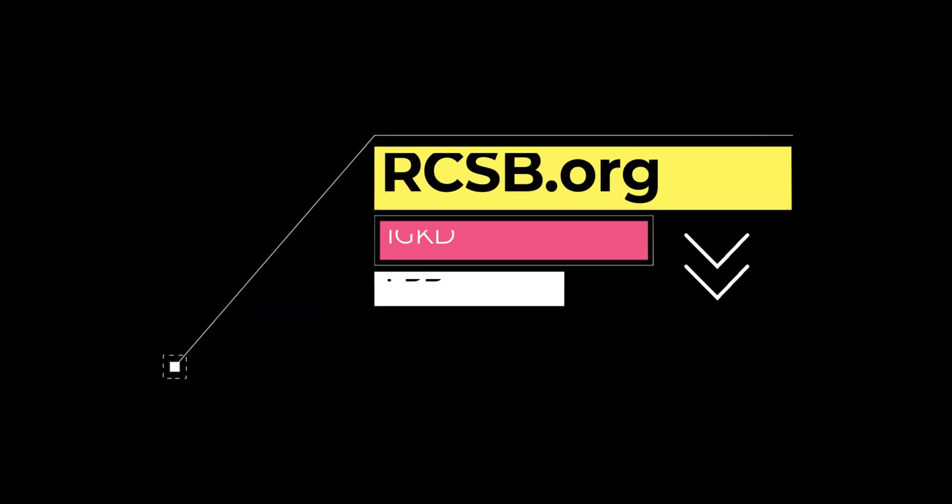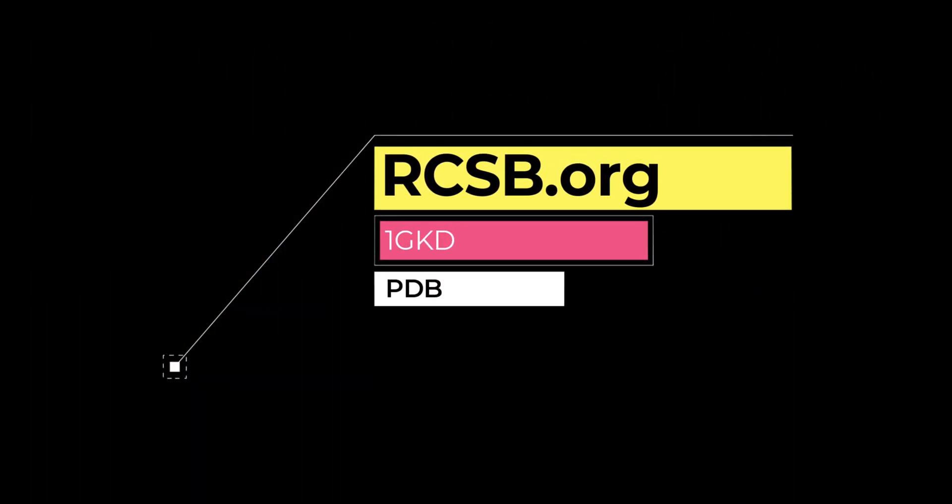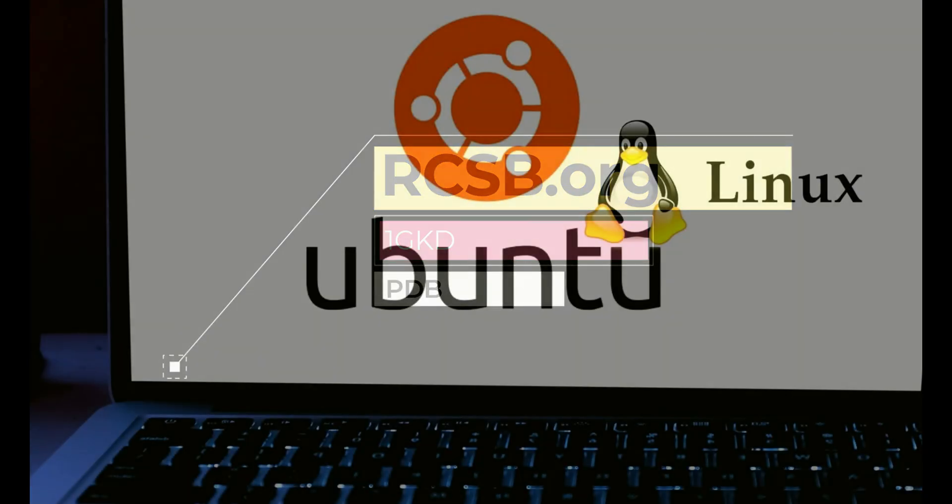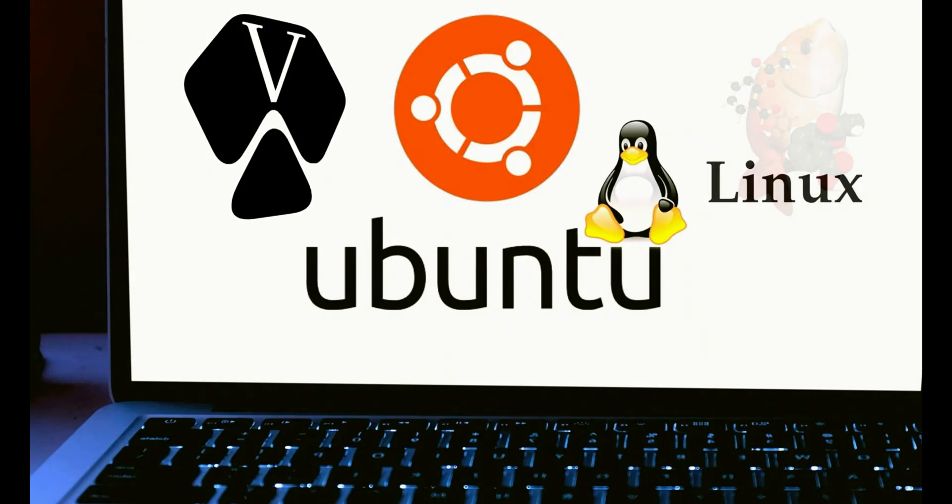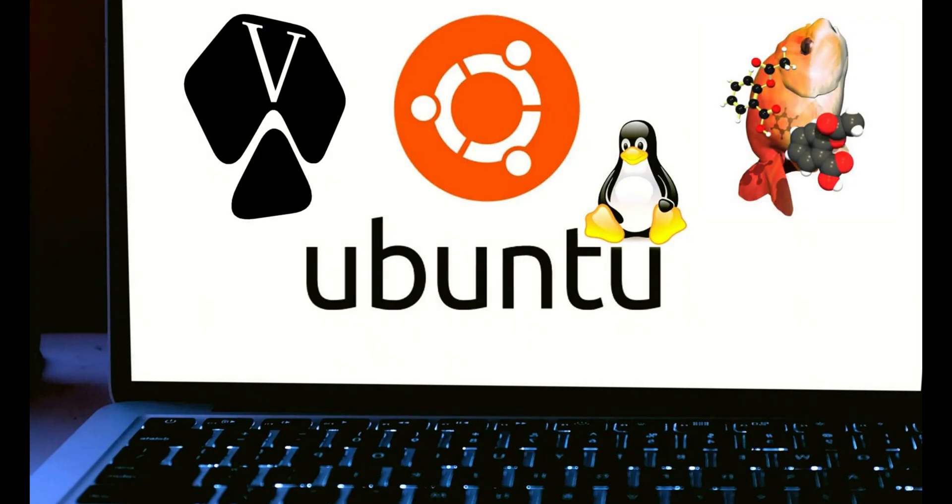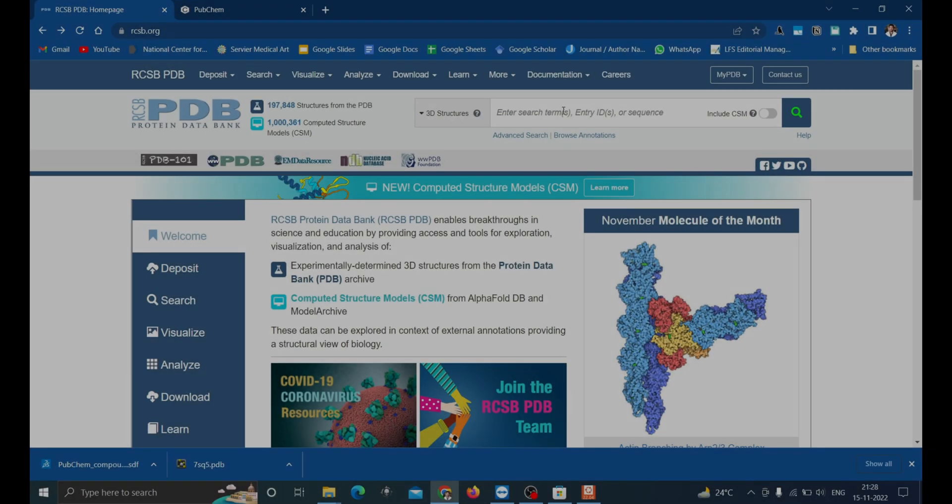In this video we'll be focusing on preparing the protein for the docking process. If you are seeing this video for the first time, you can watch our previous video on installation of Linux subsystem on Windows and installing AutoDock Vina and Open Babel for the docking process. We'll be posting a series of videos on how to do molecular docking and analysis.